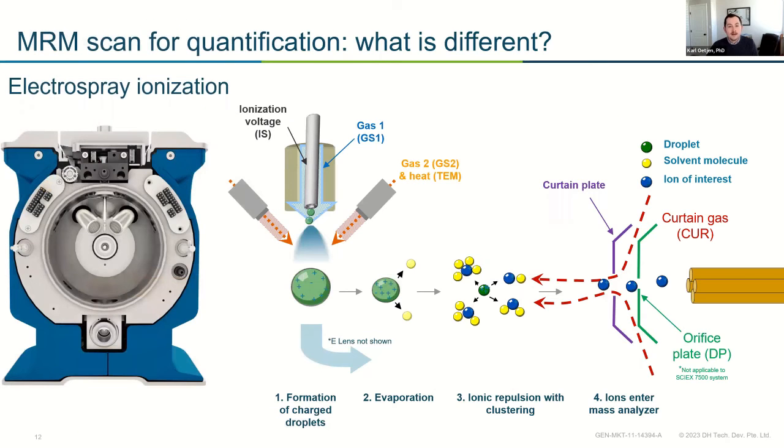Great, but how does this differ in terms of setting up a method? A lot of times I'll get asked, when someone's trying to do some of these quantitation methods and they're switching from a triple quad to a time of flight instrument, "I don't want to have to redo everything." And that's fair. Method development is fun for a while, and then it's tedious, and then it's just not fun. So I totally understand that, especially if you have thousands of compounds you're interested in across multiple different methods. And the good news here is that it's really not all that different.